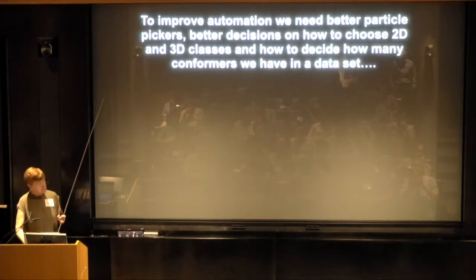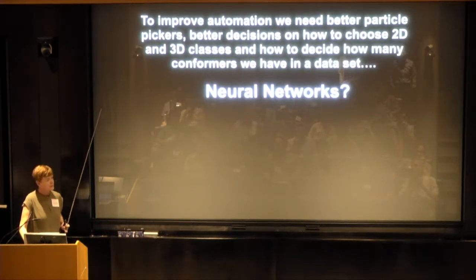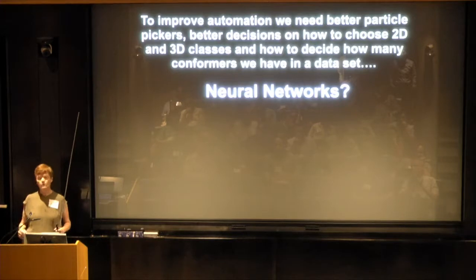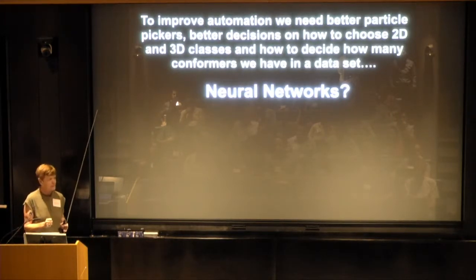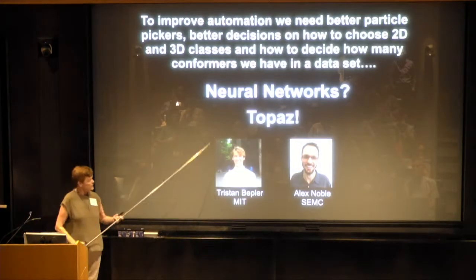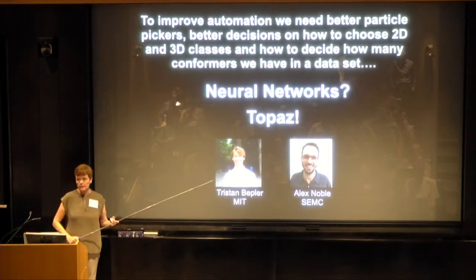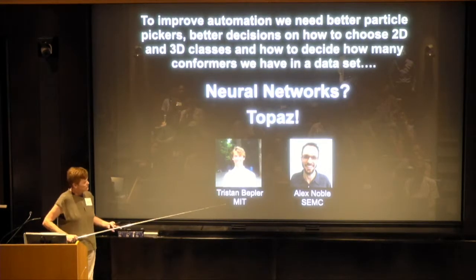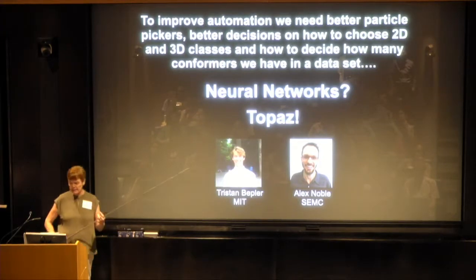I have thought neural networks might be able to help us with this for some time because people are doing this, but they're doing it a billion times. So we're capturing a lot of training data because people are doing it every day. And there's a program called Topaz. I think Tristan is here. I thought he was coming. Anyway, Alex will be here tomorrow. And these two, Tristan's a neural net person from MIT, and Alex is in our lab.